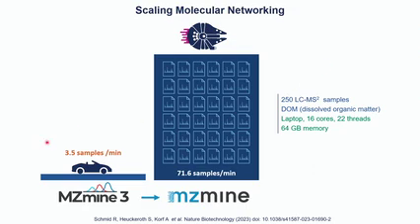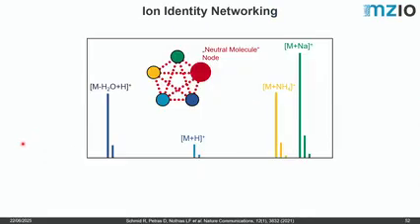And also, what we would like to highlight is that we have really improved the molecular networking speed in mzmine, and it's also way faster now. So please try it out if you feel like it.